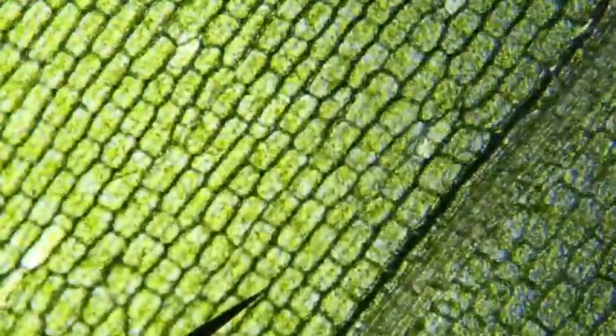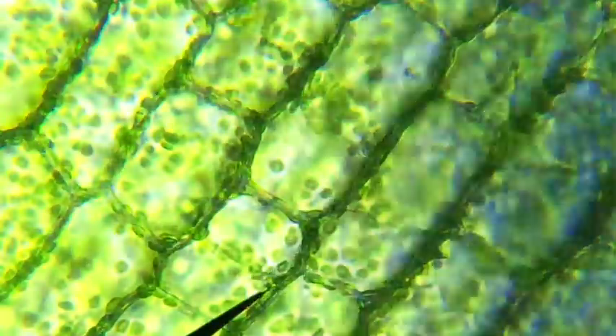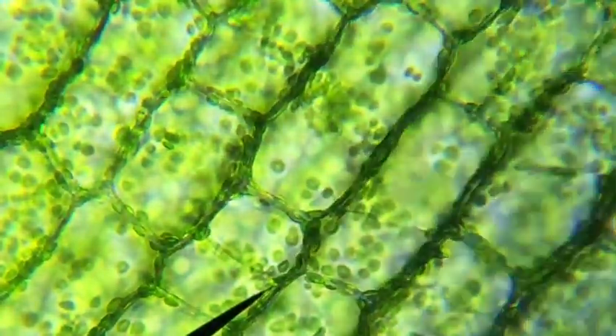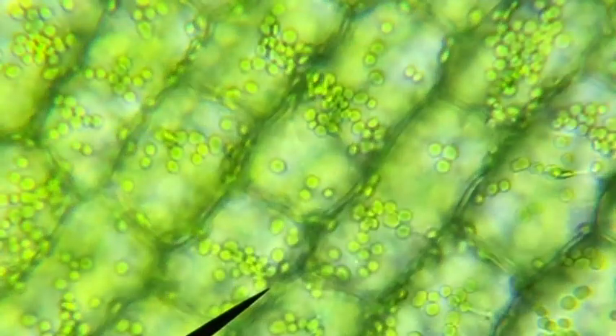Sometimes as you're focusing you might see one cell layer in focus, then you keep moving and another one moves into focus. You could try to go to high power to see what's visible there. Under high power the chloroplasts are highly visible.